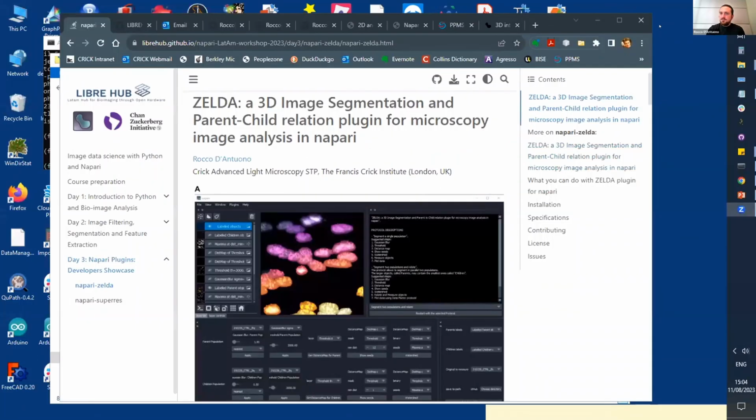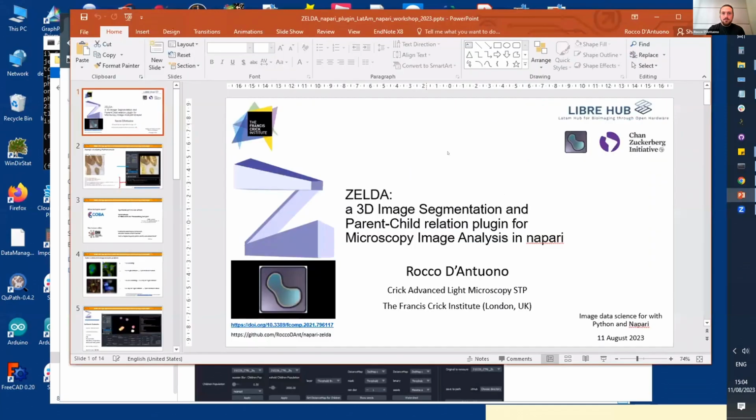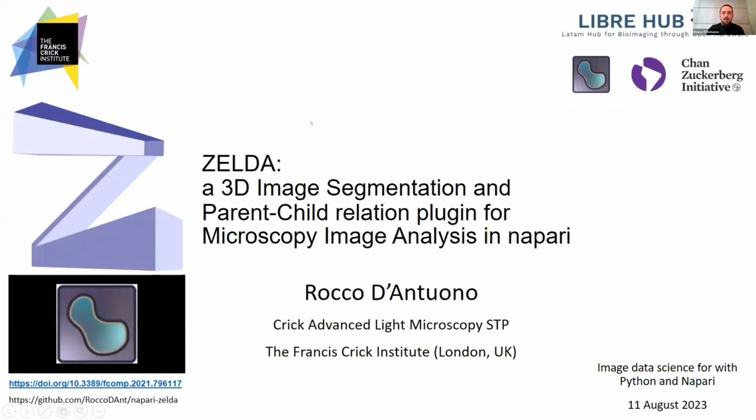Okay, so I'll start presenting about Zelda. Now, I hope you can see the screen. I will start sharing. And now I'm in presentation mode, right? You can see my slide. Correct.